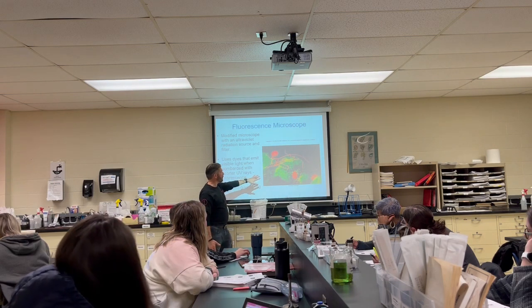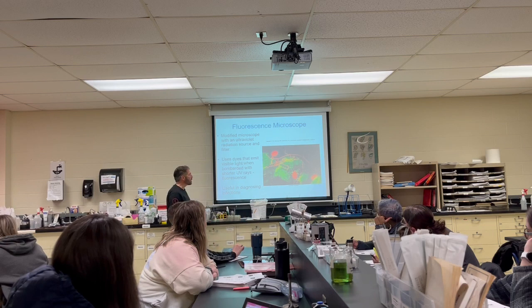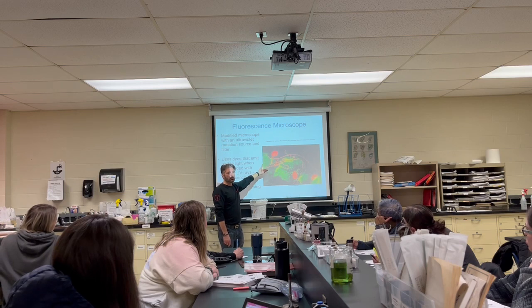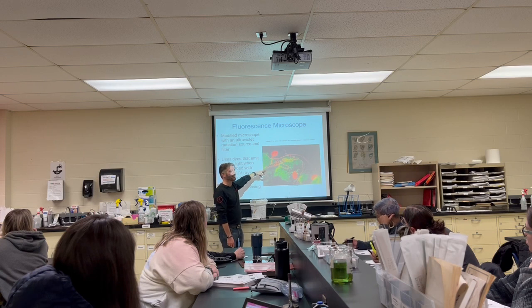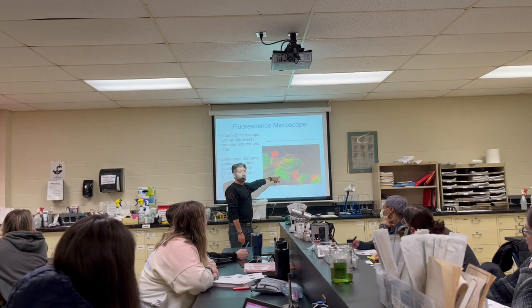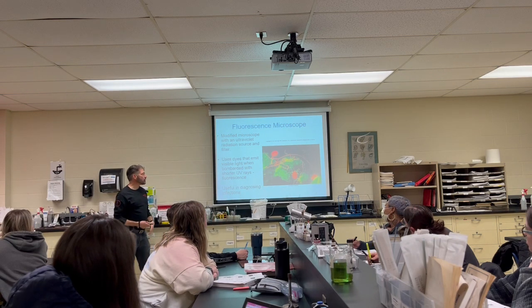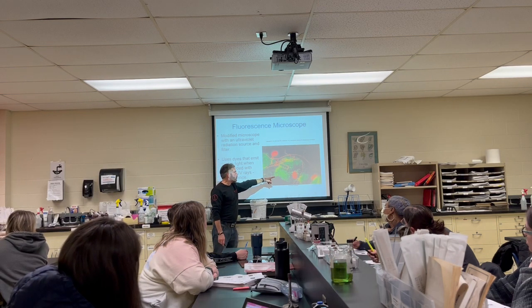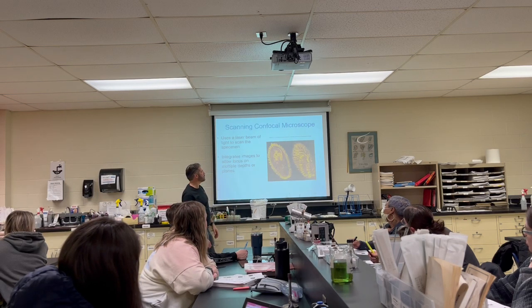So with this, can you at least see the different shapes of the bacteria? We can all sort of agree these are circles, sort of. I'm going to call them cocci from now on. No, you can't see that? Okay, these are a little bit of rods. The shapes are useful in diagnosing infections. That's a strep, definitely strep. And that's probably, I'm going to guess, E. coli, just by the shape of it.